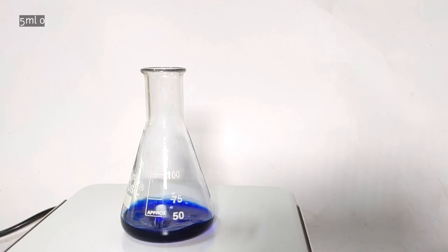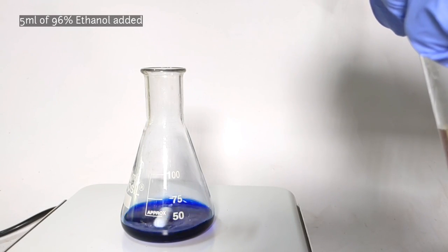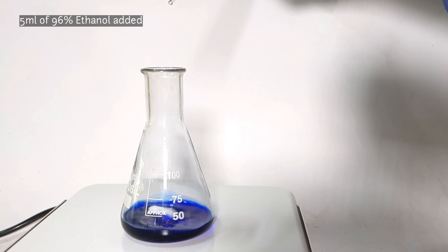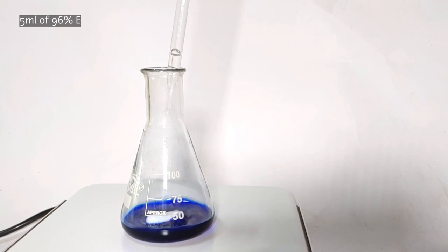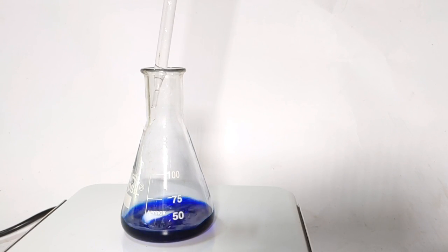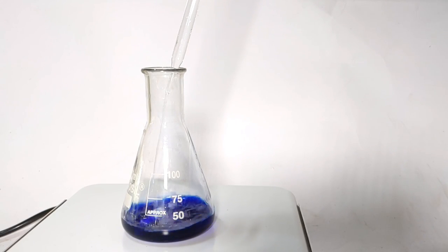From here, things change a bit. The literature tells us to add about 5 milliliters of 96% ethyl alcohol to the solution of tetramine copper sulfate. This would reduce the polarity of the media, causing the complex to crash out of the solution as micro-crystalline powdery product.